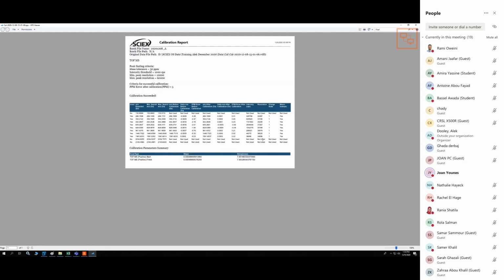Okay, great. I have also one last question about the error before calibration. If the error, let's say, was above 2 ppm, like in this case that you opened, as you can see on the low masses on the 200 and the 300, it's more than 2 ppm. So our confidence is a bit compromised.